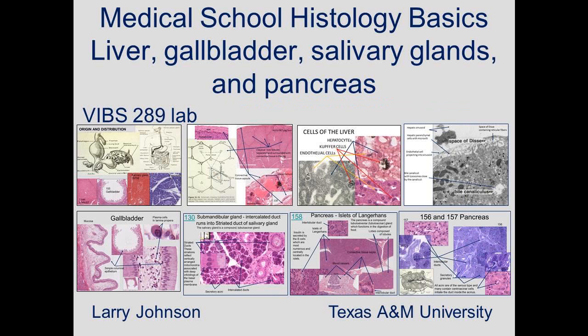Medical school histology basics: liver, gallbladder, salivary glands, and pancreas. Hi, I'm Larry Johnson. I am a professor at Texas A&M University, and today we're going to talk about the accessory organs for the digestive tract.